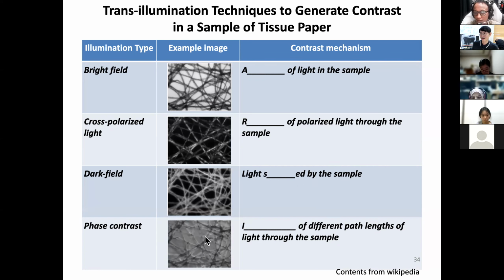Phase contrast microscope. What's the contrast mechanism? So, phase we cannot see directly. That's why we convert the phase into intensity. How can we do that? Anyone else? Interference. Okay, coherent. Ding dong ding. Great. That's the interference. Interference makes this phase into intensity.